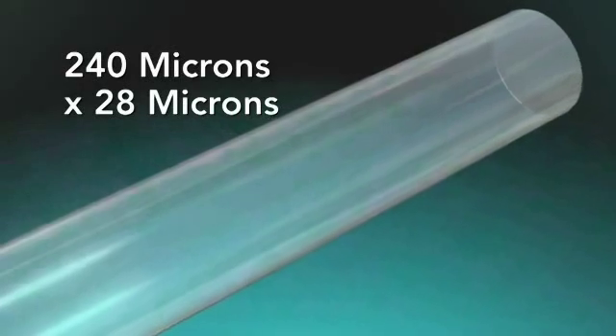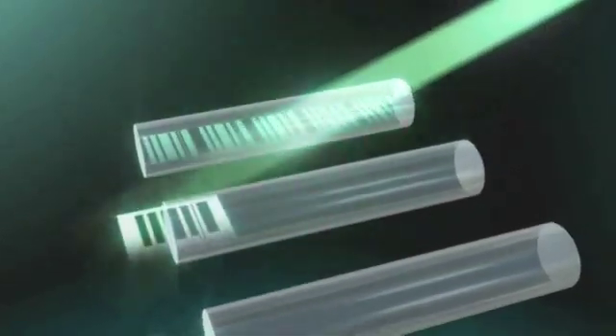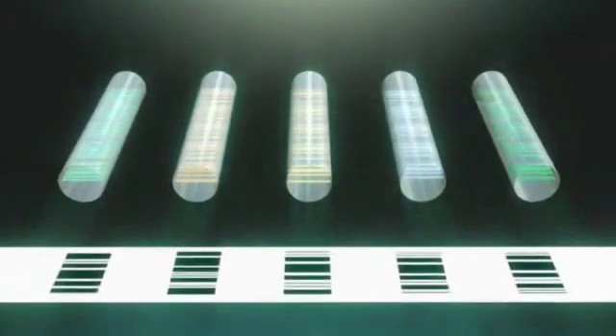The Veracode technology utilizes glass microbeads embedded with digital holographic elements. When a laser beam passes through the bead, it is diffracted by the holographic elements, creating a code image which can be detected with a conventional CCD camera.